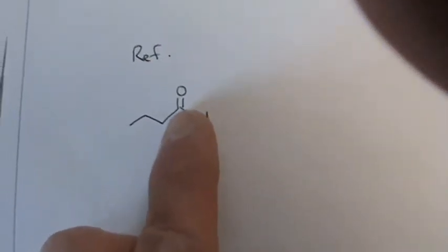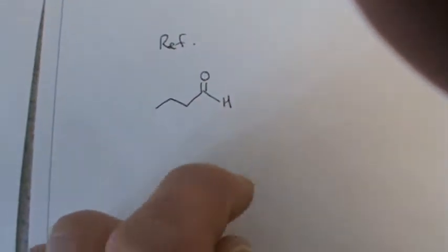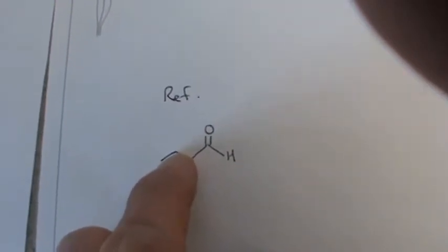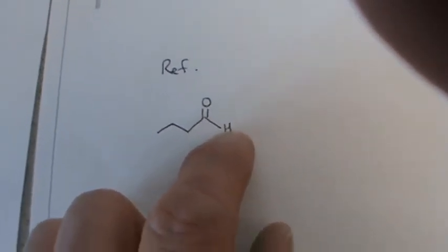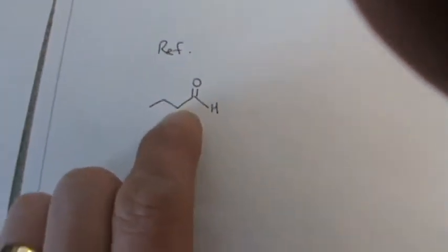So it's no surprise that even though we're setting this to be 1, the area under it, the ones over here are not going to work out that great because their phasing is not the same as this. So just to let you know, you don't have to panic, and it's clear that that's a little triplet. All it means is that hydrogen, and it's normal, because you have an sp2 carbon there, it's actually talking to these 2. So it sees these 2, does a little bit of splitting. This will be a triplet. And that also means that these 2 have to be talking back to this 1. So these are going to talk to these at a coupling of, say, 7, but it's going to talk to these at a coupling of maybe 3. So the way this is talking to one neighbor and the other, not going to be identical, so it's not going to be a pretty looking signal.